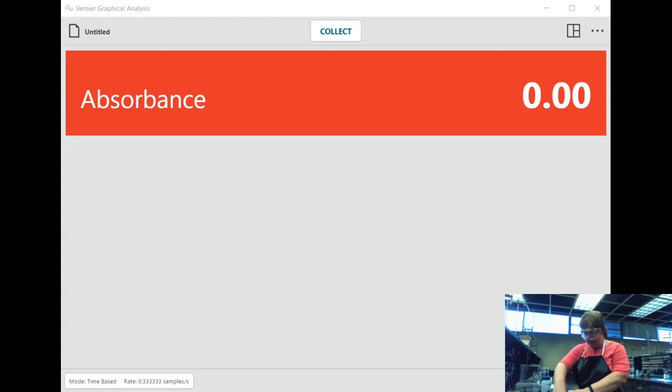And the red light stopped blinking, so it's done. I open it up, and now I'm going to take my stock solution, and I'm going to see what it reads at this one. Note that this is significantly higher. This is at 470 nanometers, and this one happens to be significantly higher. So I would record down 470 nanometers, 1.10 or 11. It wouldn't matter either one. Absorption, I'd say 1.11.